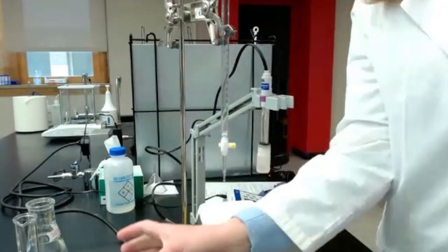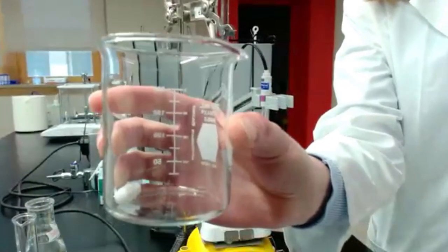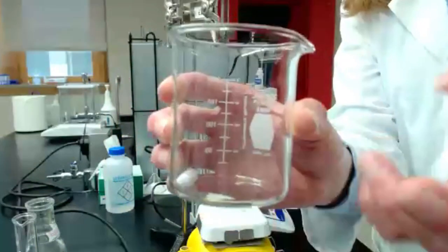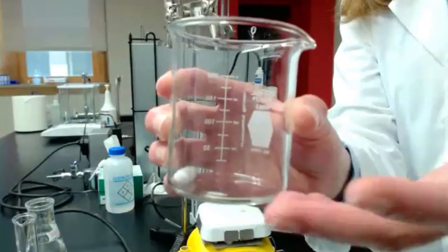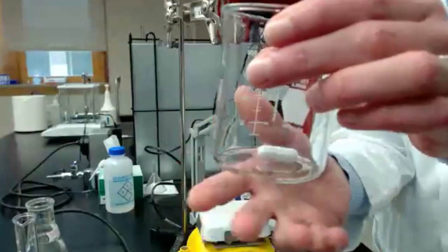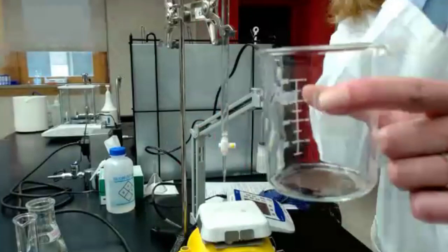You should also have a beaker. A beaker is a glassware. If you don't have a beaker, but you have the same type of thing with a flat area, that's what you're going to use to do the titration.